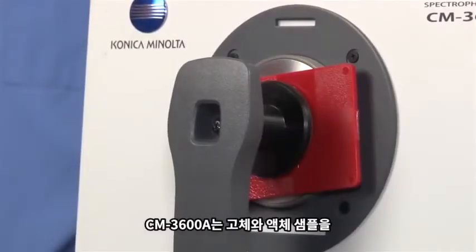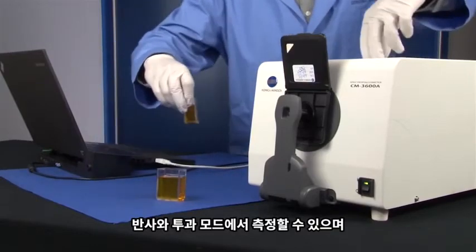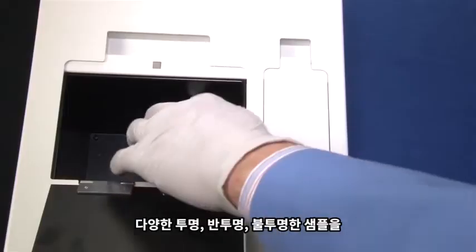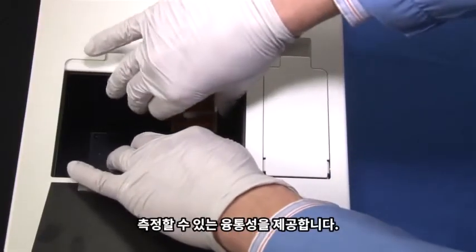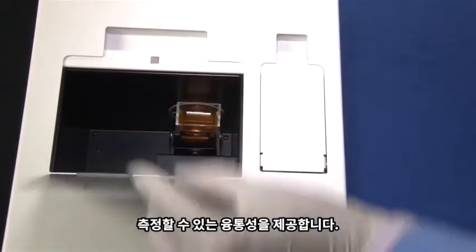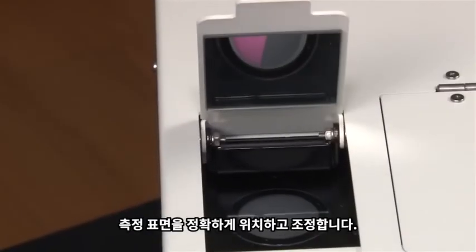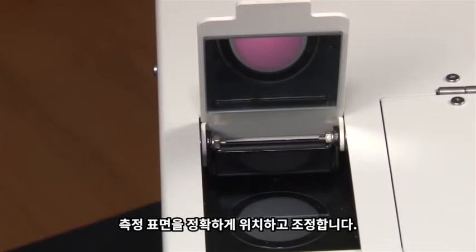The CM3600A measures solid or liquid samples in reflectance or transmittance mode, offering great flexibility for various samples ranging from opaque, translucent, and transparent. The sample viewer provides a clear illuminated view of a sample to accurately target and control the measurement area.